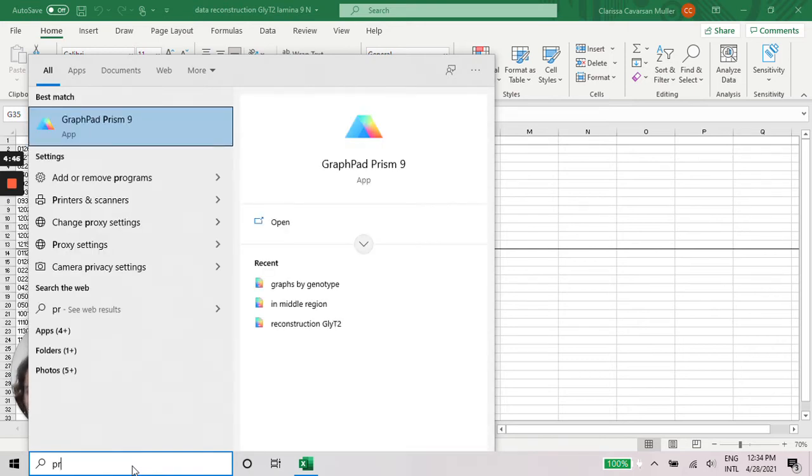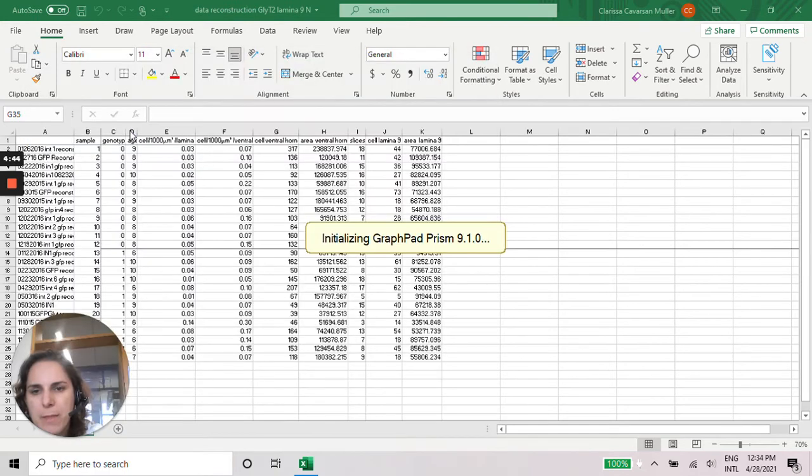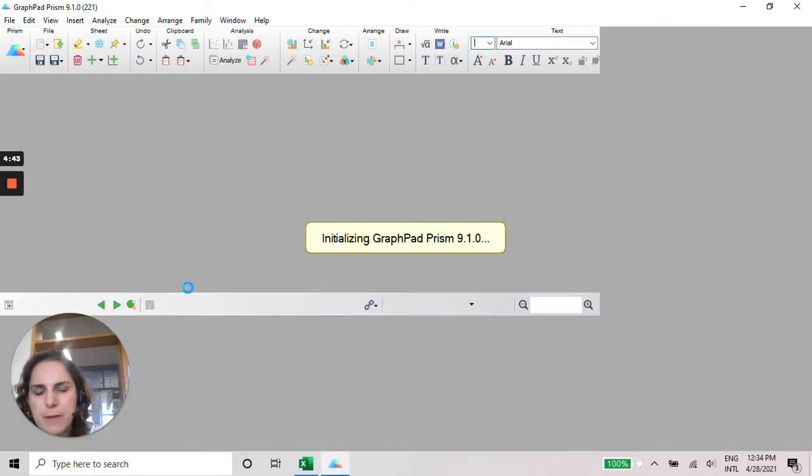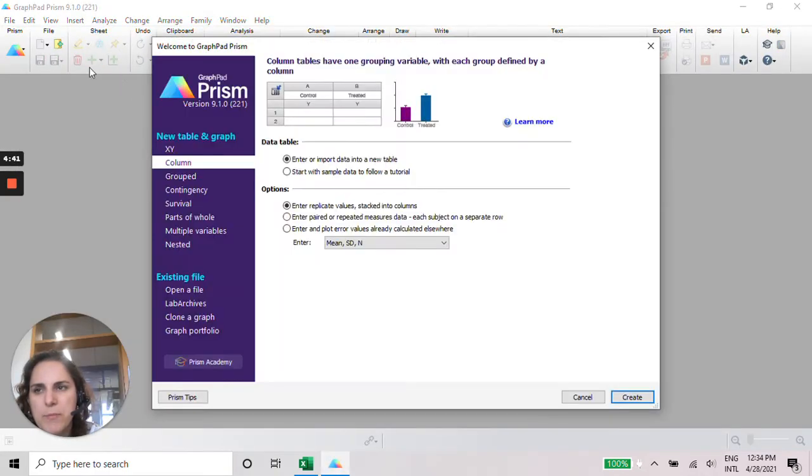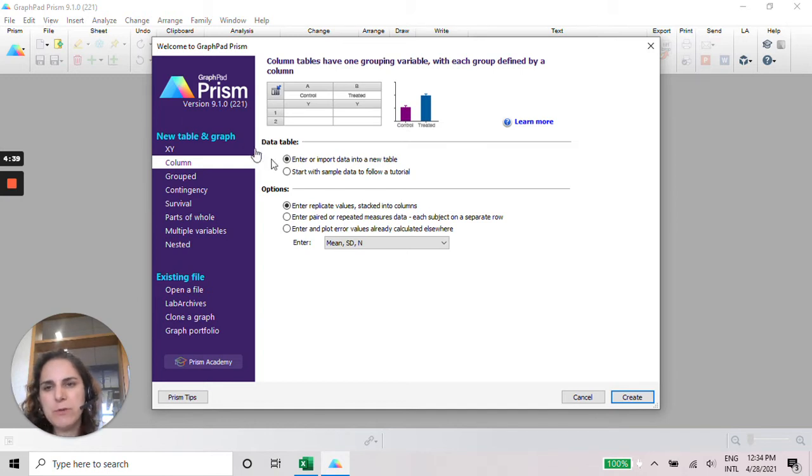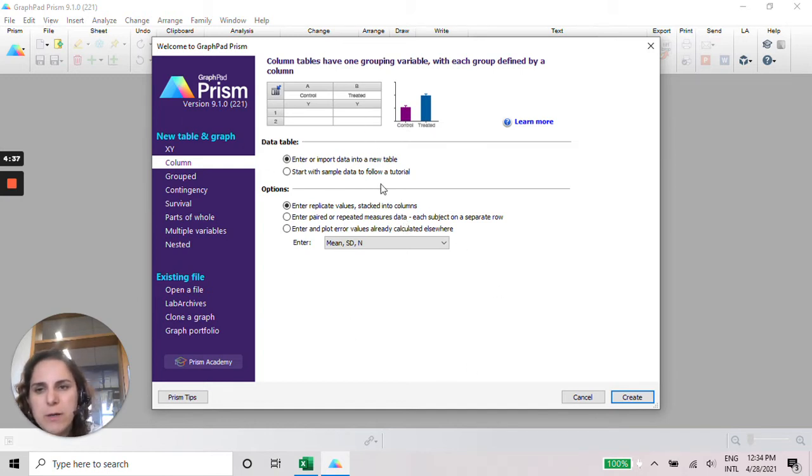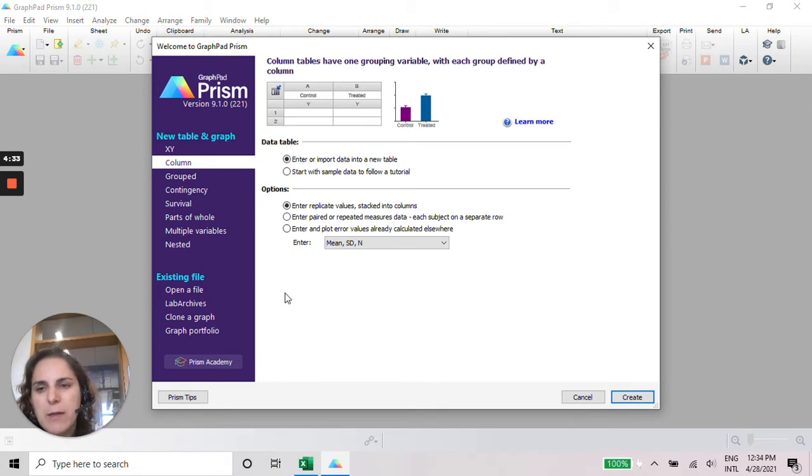So let's open this one. When you open GraphPad Prism, you're going to pop up this window here where you can choose the type of graphic that you want to make. There are several different types, so you can make an XY graph, a column, a group.